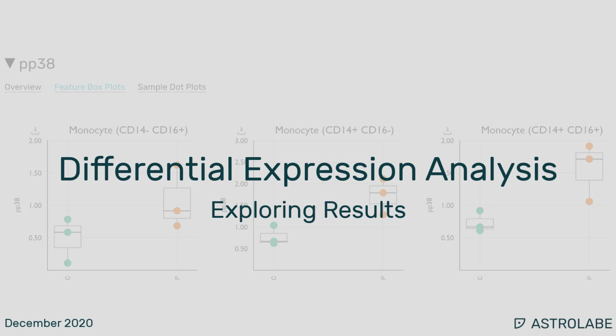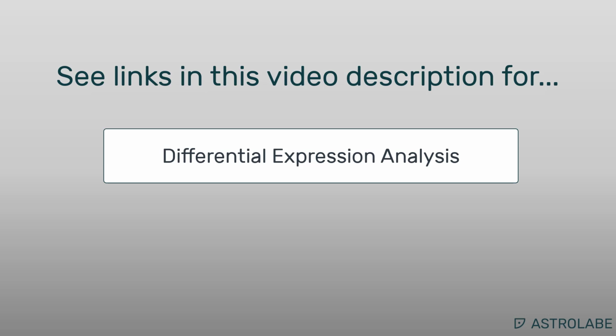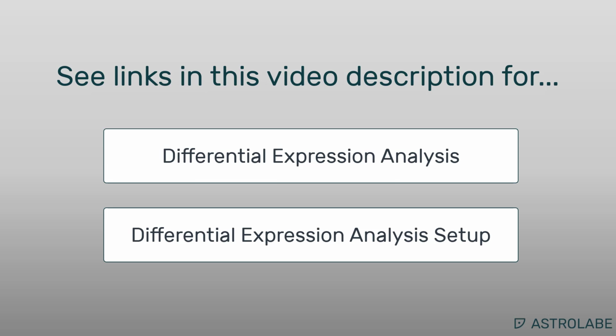In this video, I will discuss how to explore the results of differential expression analysis for your experiment. This video will build on material presented in other tutorials. If you need a refresher, you can find links to tutorials about differential expression analysis and differential expression analysis setup below.